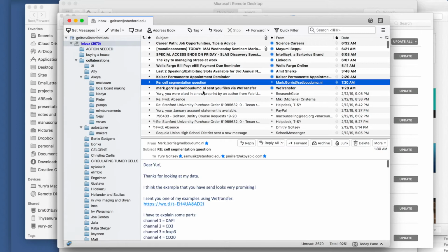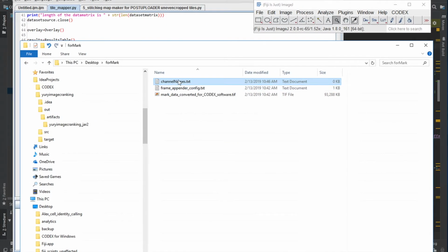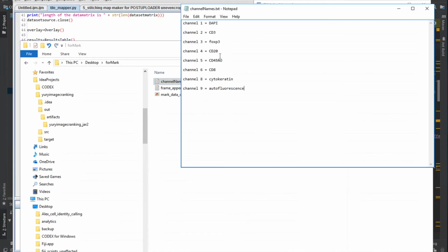Here we go. Perfect. These are your channels. Alrighty. That's actually weird. I don't think this is right, because I think your Cy5 is in a different channel.